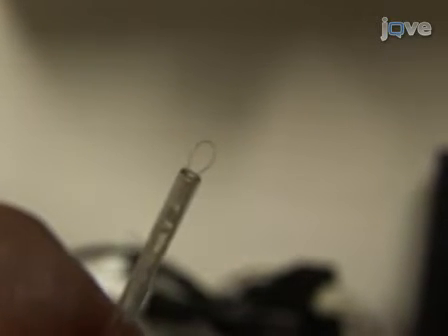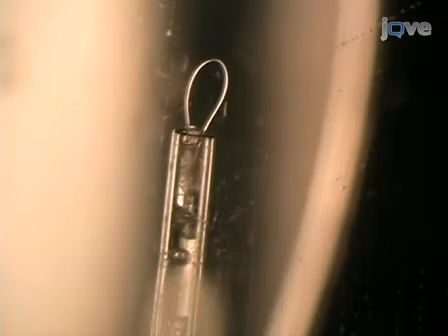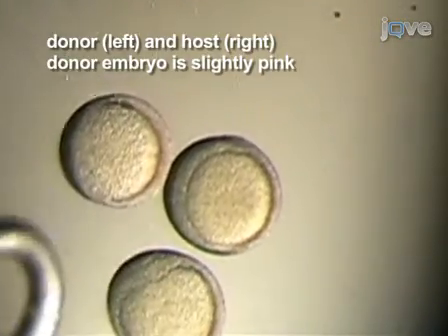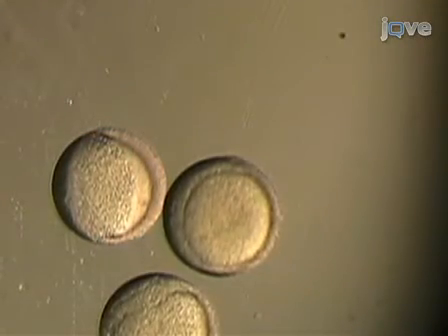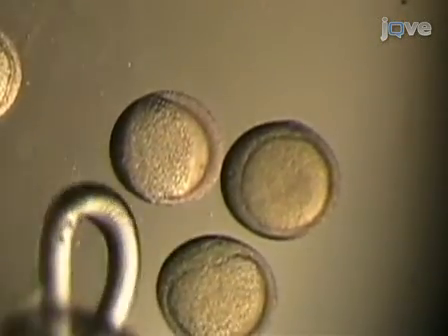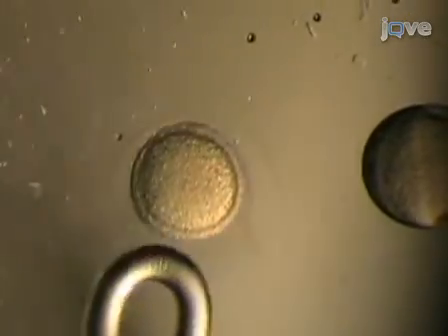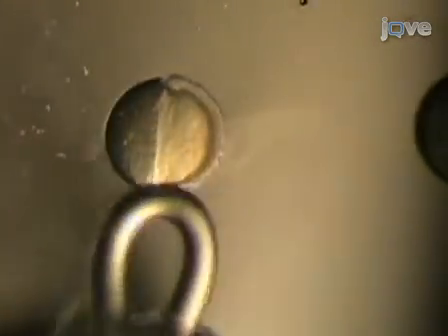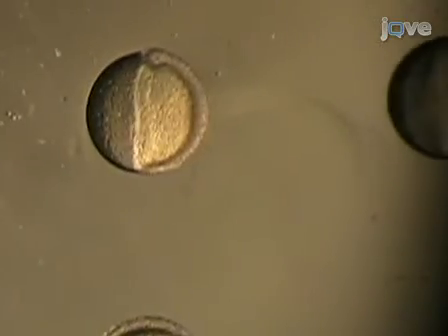A new tool is required to manipulate the gastrulas. Glue the ends of a short length of 2-pound test fishing line into the end of a capillary tube, thus making a small loop. Use the loop to gently roll the donor and host embryos up onto the top of the methylcellulose strip, and stuff them down into the methylcellulose until secure. Roll them into position so that the targeted region is uppermost, since during transplantation, the needle will enter the embryo tangentially to deliver the donor cells without damaging the yolk.